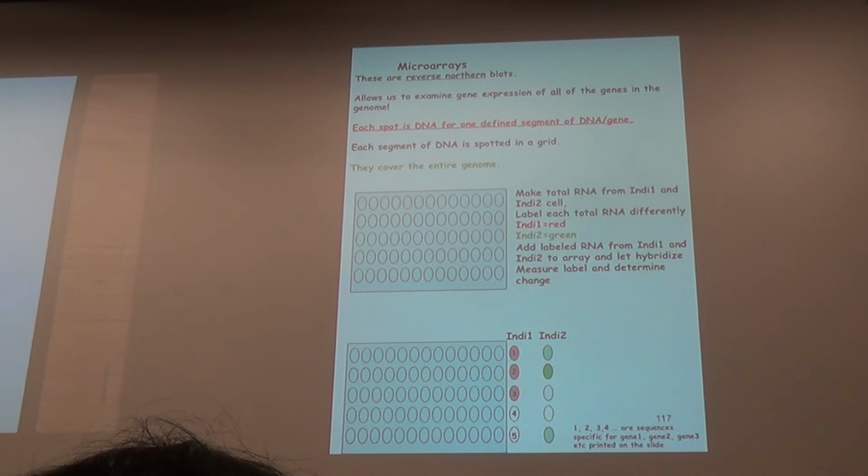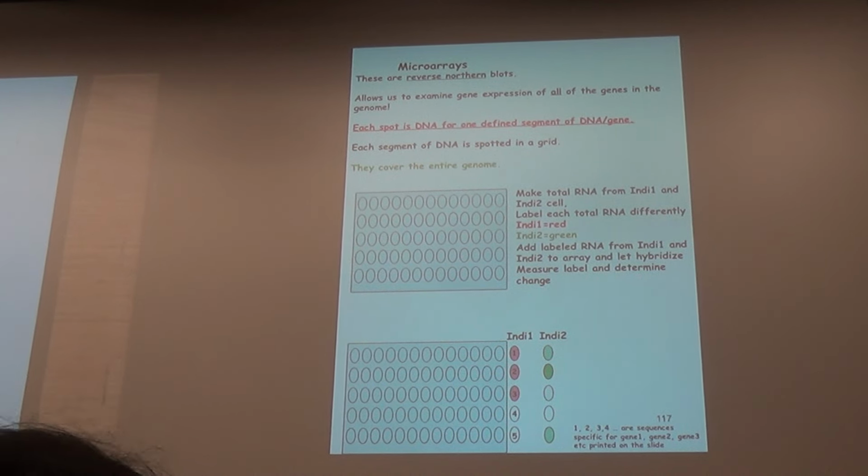Or vice versa, whatever. So you can see how you can measure these signals, and from that you can talk about all 30,000 genes for each individual. You get a picture of the entire genome and its expression pattern. And you can do this for one cell type, all cell types, it's up to you, how many times you do it. There are many, many different types of cells in the human body. You can isolate RNA from all of those cells and individually analyze them by microarrays.